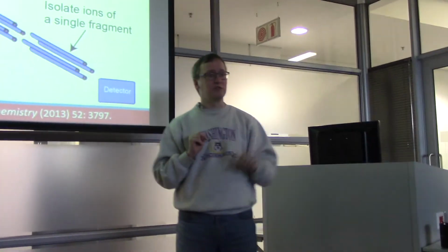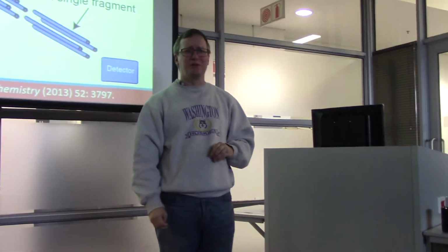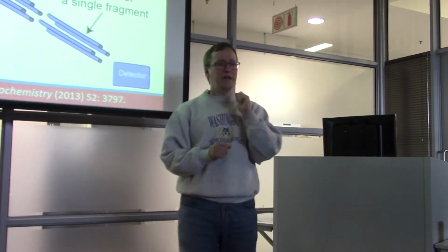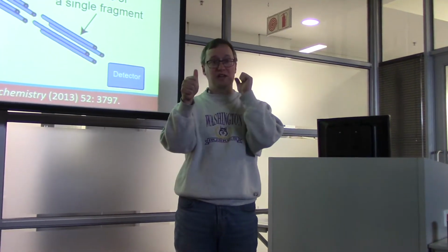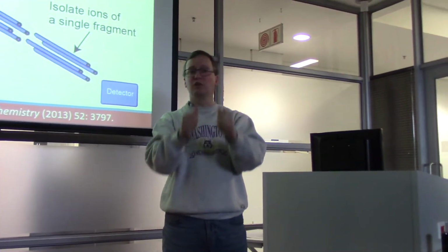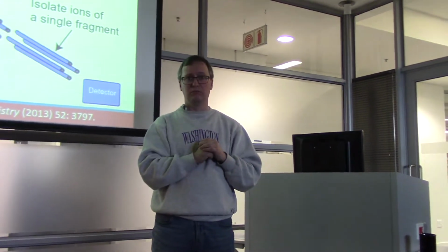Transitions, that's a really important term. Even if it doesn't appear on the slide here, the term transition is one you should definitely know in connection with targeted mass spectrometry. A transition represents a particular peptide mass to charge value and a particular fragment mass to charge value that together are something you can measure to quantify how much of this peptide is there.